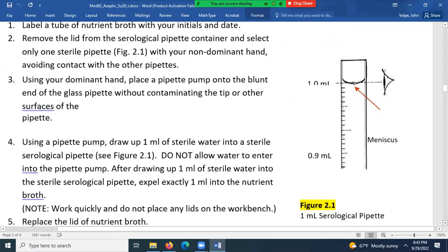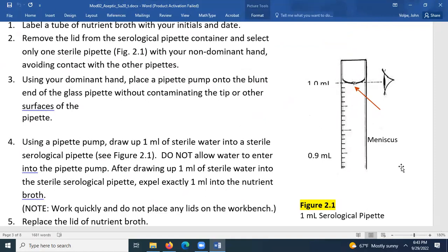When you're transferring 1 ml, you should realize that water and many other things, when you're measuring on the pipette or the buret, that's not how you say that. Close enough. It's marked, buret. The water will form a meniscus where it'll be higher at the sides and lower in the center. How do you read this?